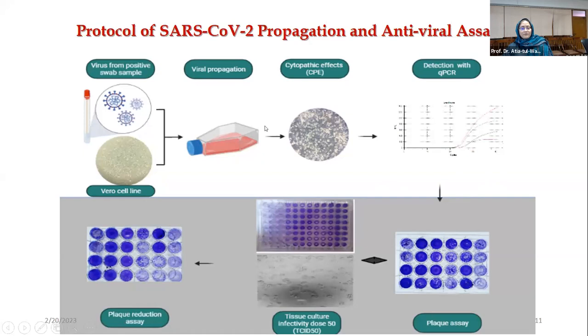We have in our institute Dr. Saba Farooq, who is in charge of this lab, and she has performed these experiments. We have grown SARS-CoV-2 in a cell line, and then treated these cell lines to observe the cytopathic effect.